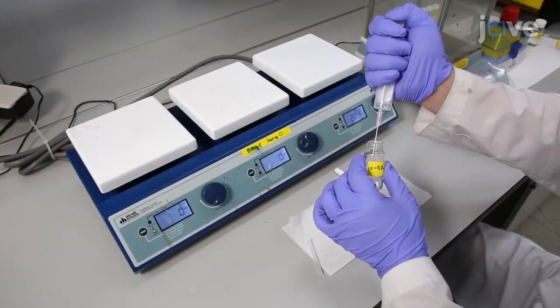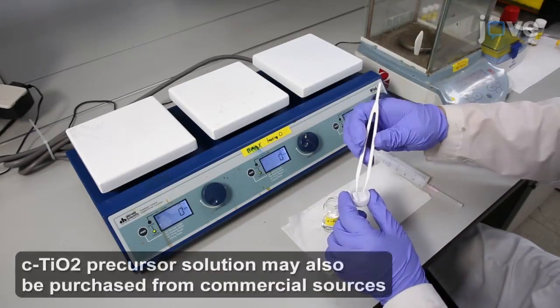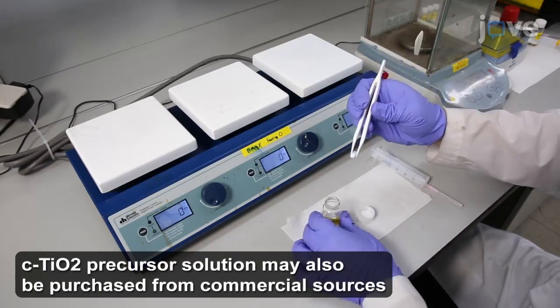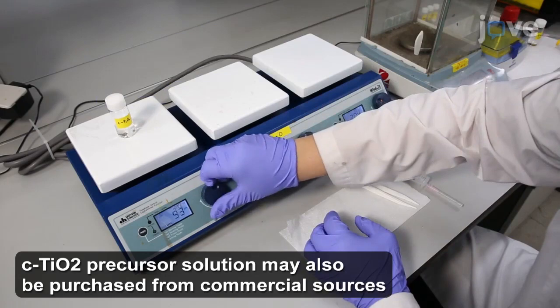To begin preparing the precursor solution for compact titanium dioxide layers, place 8 milliliters of anhydrous ethanol in a 20 milliliter glass vial and start stirring it vigorously.